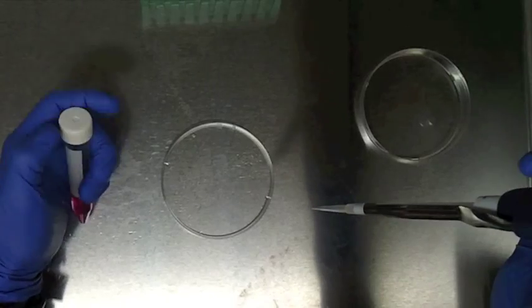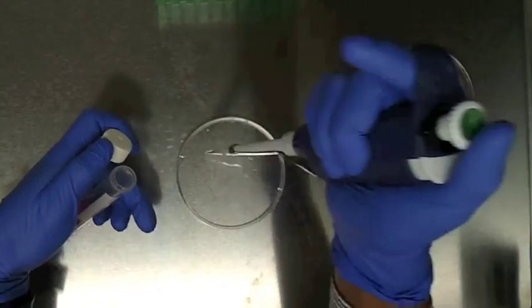Next, we plate 27 microliters of the culture onto a petri dish.